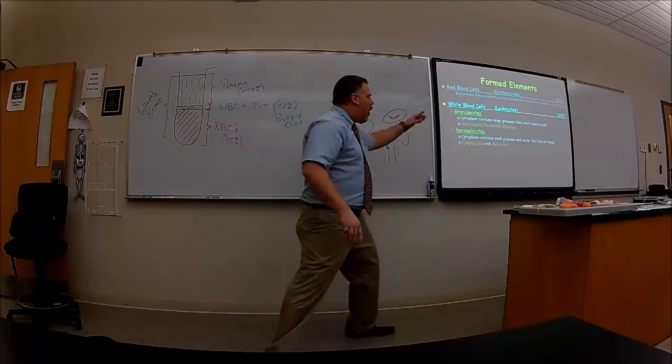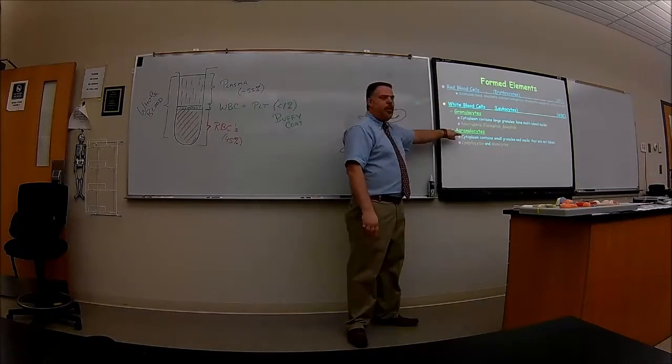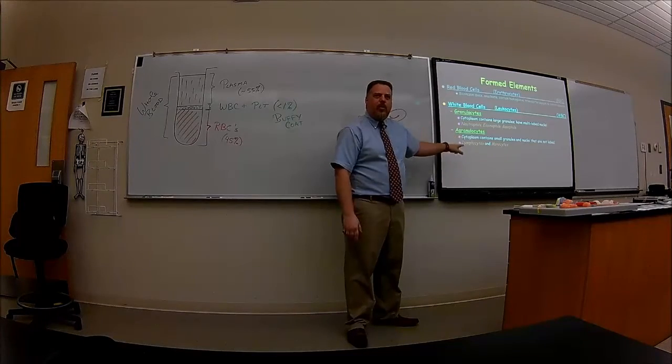All of them have granules, except you can't see them with the light microscope, but they're there.